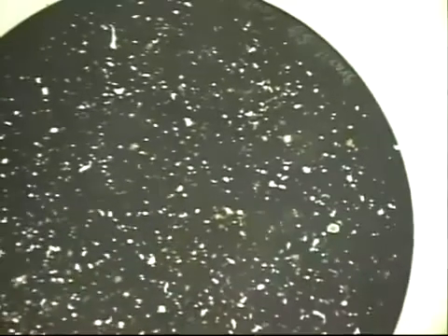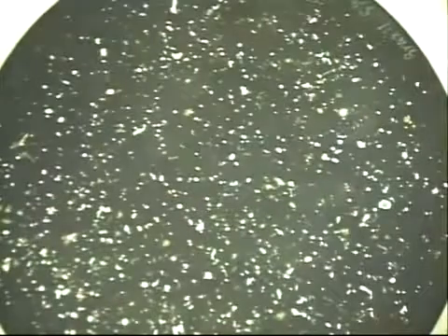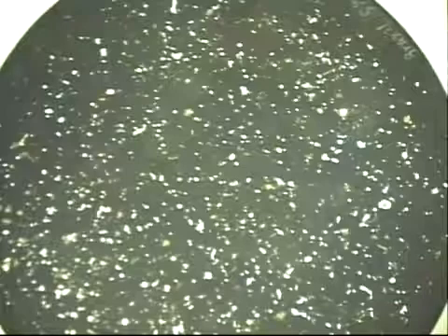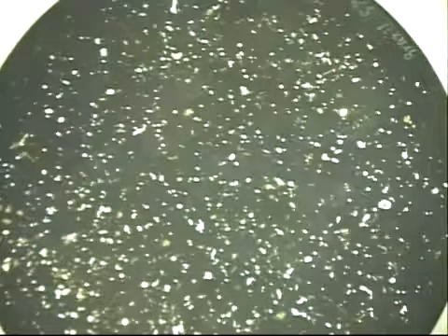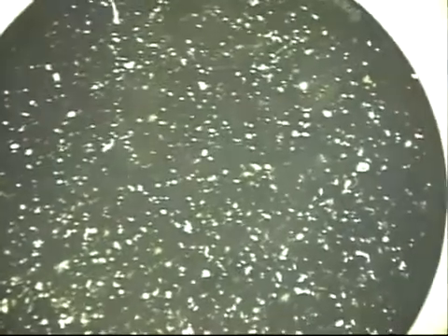The process, as I mentioned during the lecture series, also produces a black hand sheet, which you see here. Against a black background, that's not too clear. I'll move it over against the white, but you can see now it is black and white. The white portion is the stickies. You can perhaps see the brown, maybe not so good.